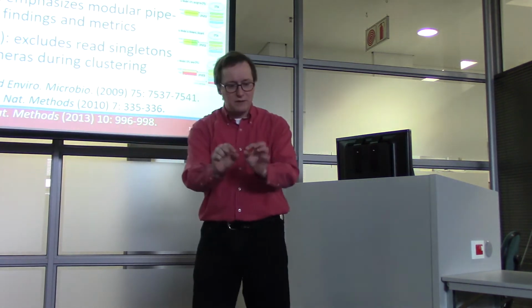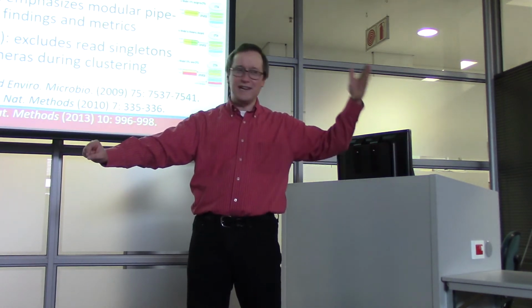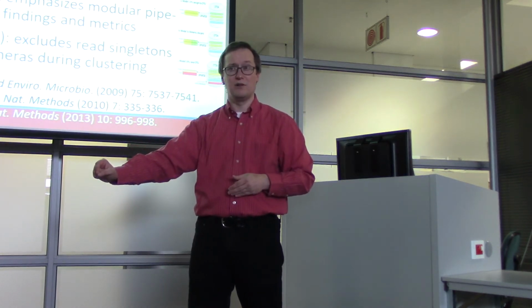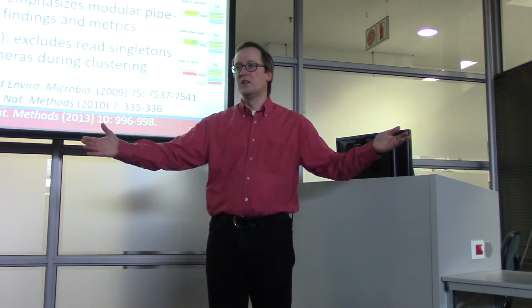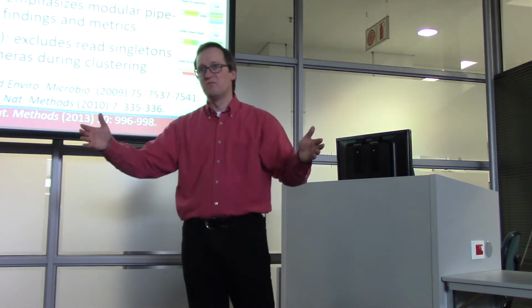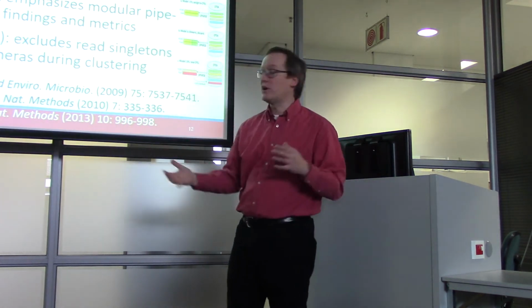So I can enumerate all the different sequences that I see at this particular location, and I can count how frequently each of those has been observed. All right, so that's the histogram we're talking about. Maybe you have 10,000 different sequences, but you can account for 90% of your data with only 120, right? So something like that may happen. So that's this histogramming process.